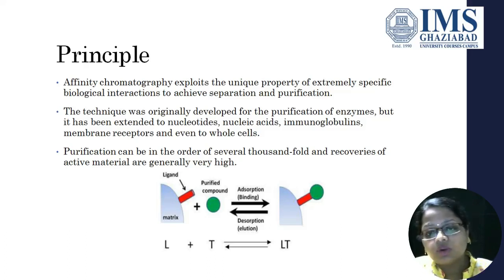The technique was originally developed for the purification of enzymes, but now it has been extended for nucleotides, nucleic acids, immunoglobulins, membrane receptors, and even to whole cells.